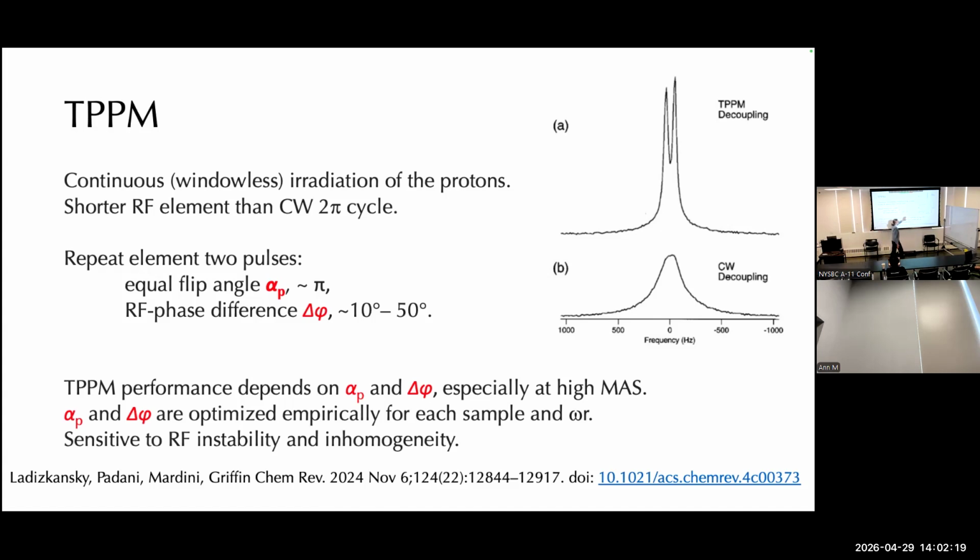But look at this difference for some cases, like I think this is a glycine pair of protons. And that's beautiful right there. It's kind of an improvement, and with a comparable RF in that case.